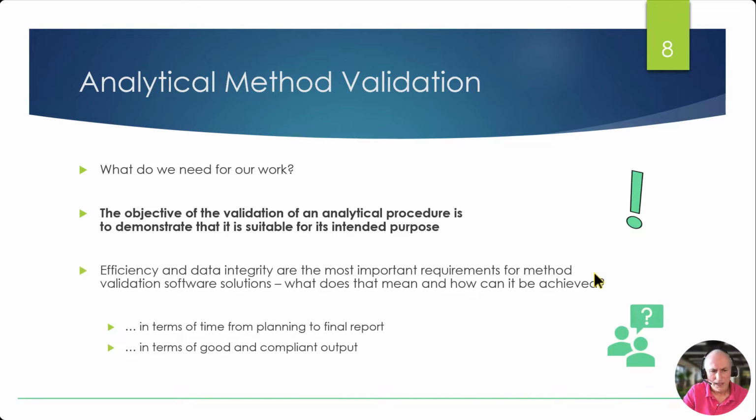Efficiency and data integrity are the most important requirements for method validation software solutions. What does that mean and how can it be achieved? In terms of time from planning to final report and in terms of good and compliant output.